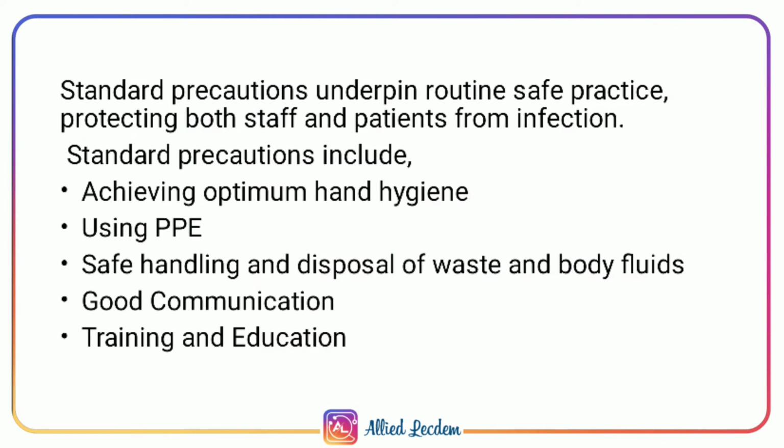Standard precautions underpin routine safe practice, protecting both staff and patients from infection. It includes achieving optimum hand hygiene, using PPE. PPE means personal protective equipment, safe handling and disposal of waste and body fluids, good communication, training and education.